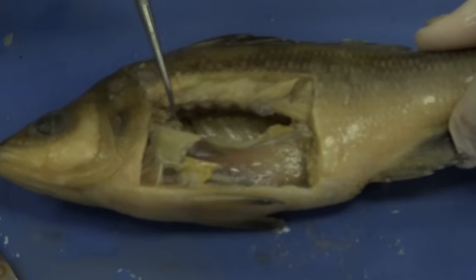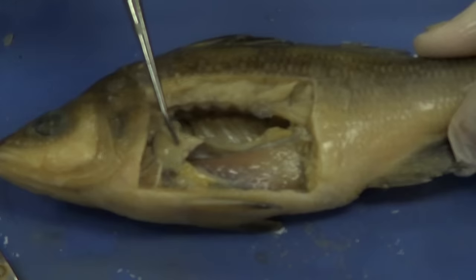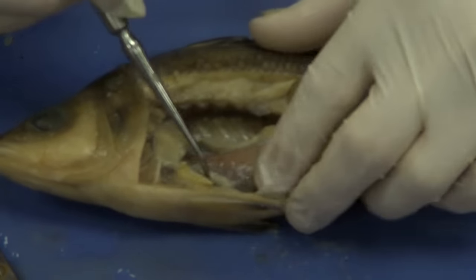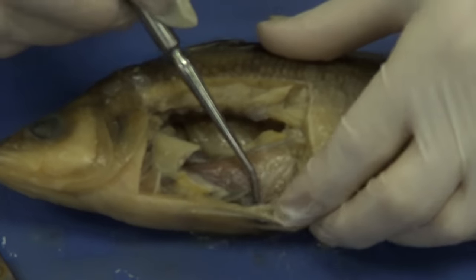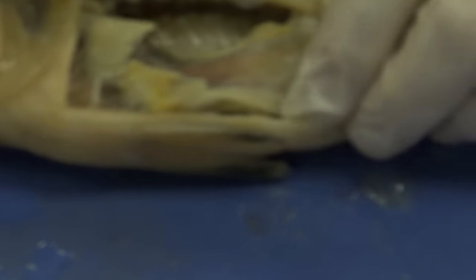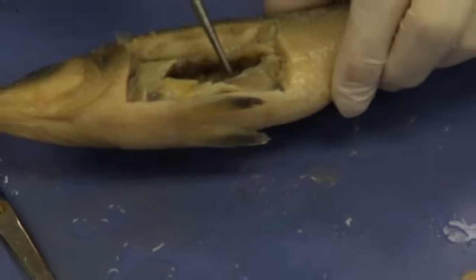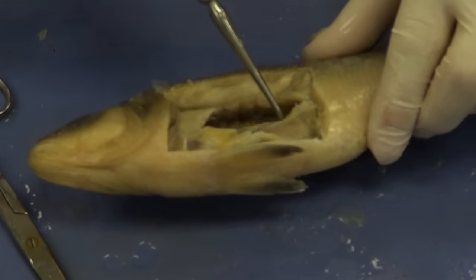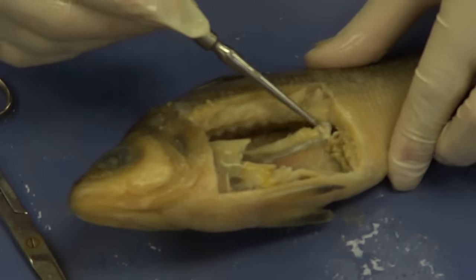Now we can see some of the other organs. The next organ is this structure right here — this is the liver. You can see a grayish structure here — that's going to be the spleen. Down below, I'm going to get my probe under that — that's going to be the intestine. If I go up to the very top, just above the swim bladder, you can see this brownish dark streak along the dorsal aspect — that is going to be the kidney, and the kidney actually comes down.